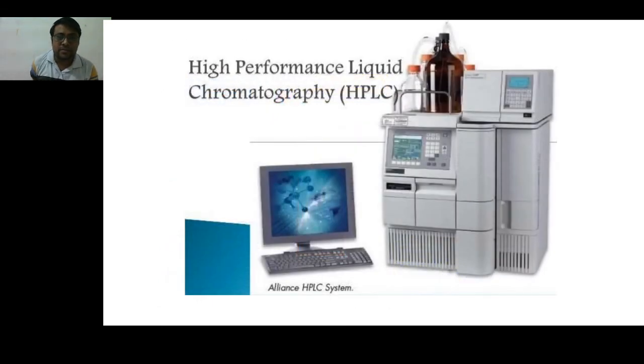This is the PC which is attached to the HPLC. This is the reservoir. From the reservoir, some pipes go into the column. The column is placed in the bottom chamber. Here is the sample chamber. This is the panel from which we can give the specification of analysis.